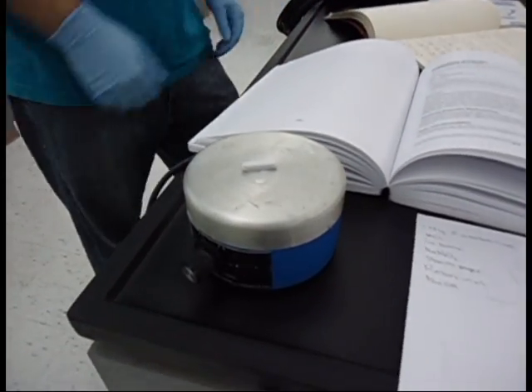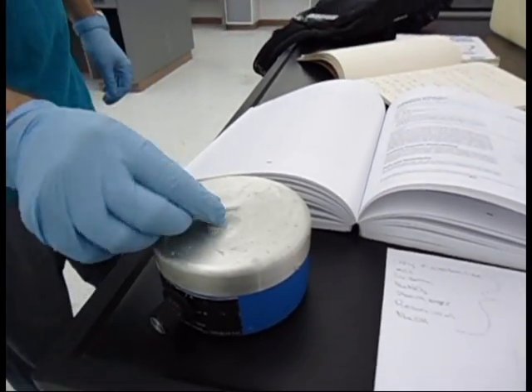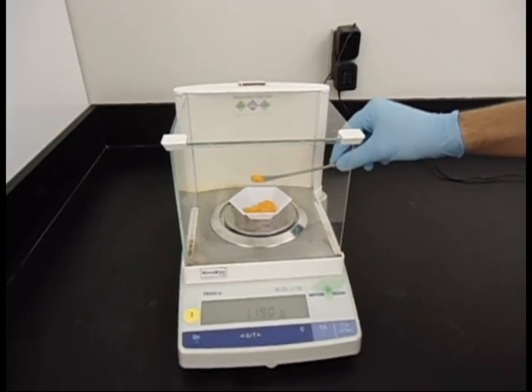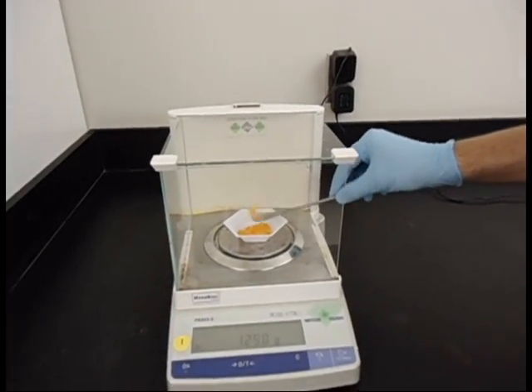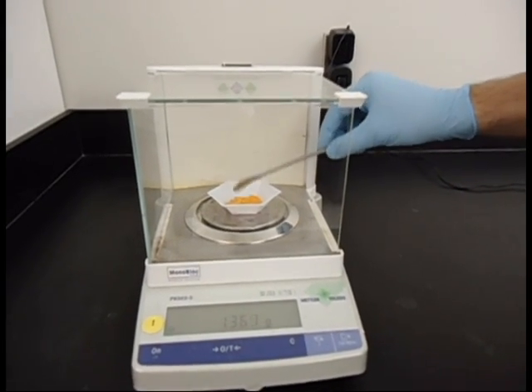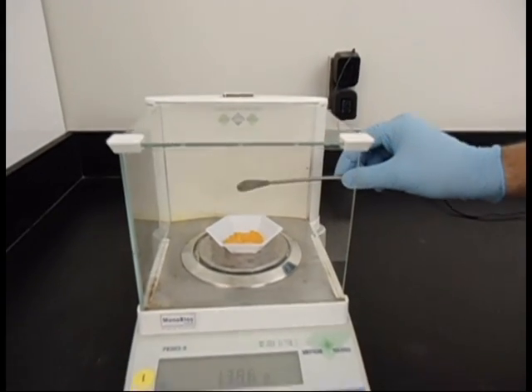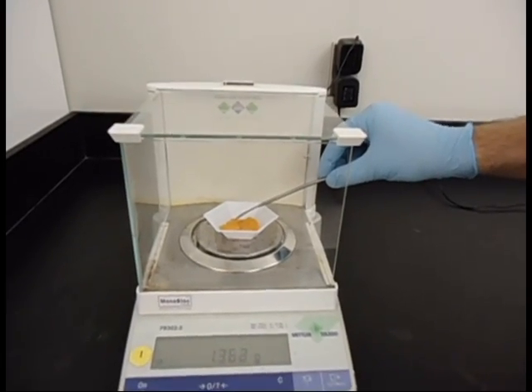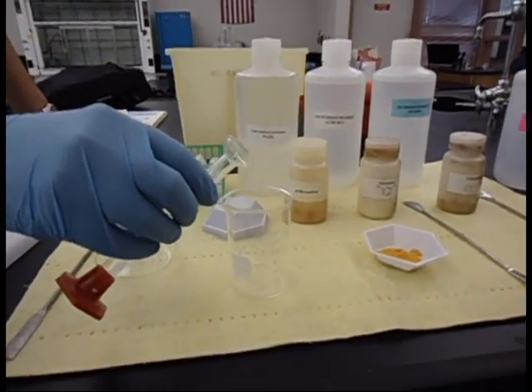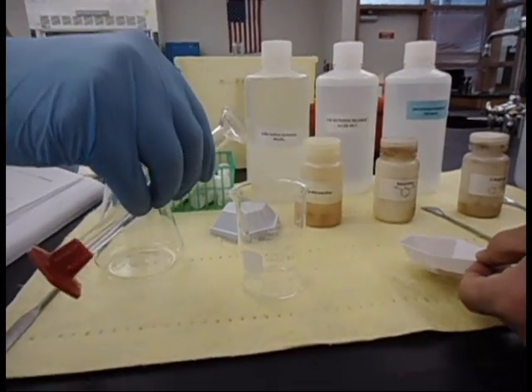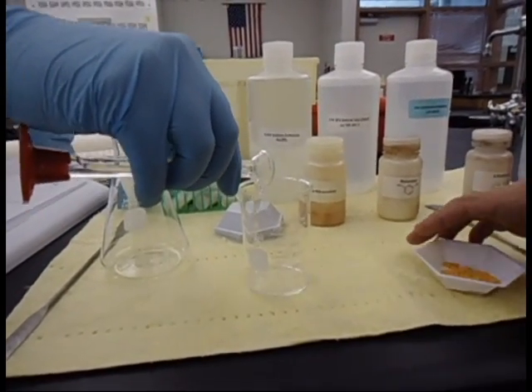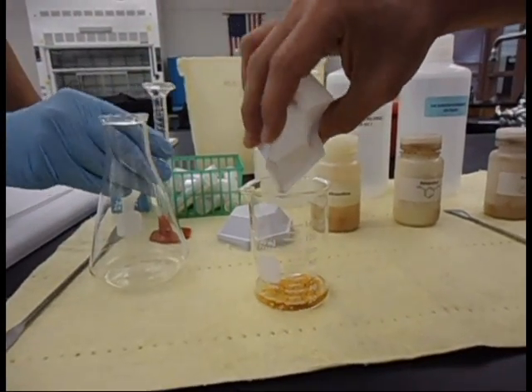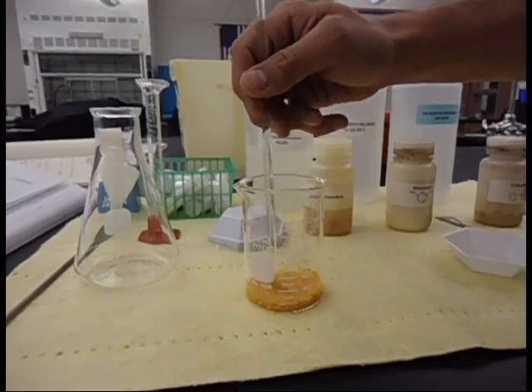In this step, we're measuring out 1.381 grams of p-nitroanilin. Now we have eight milliliters of three molar hydrochloric acid, and we're going to dissolve the p-nitroanilin that we measured out earlier in the hydrochloric acid.